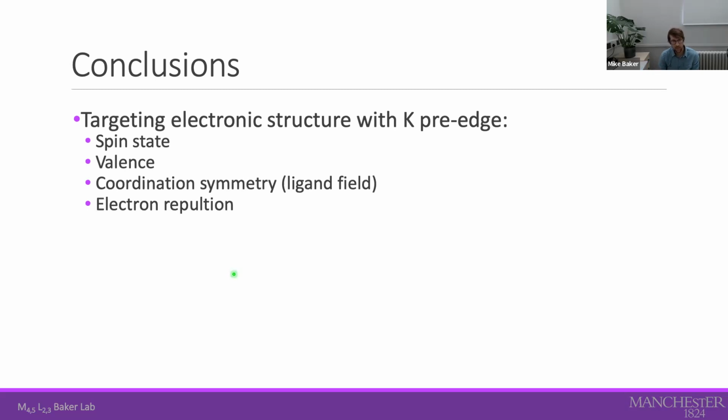Ab initio theories can be good at estimating this. However, by comparing to experiment, one can then scale those Slater integrals to get a more precise quantification of electron-electron repulsion. And that can have implications on covalency, the amount of delocalization, for instance, of the 3D ions reduces an electron-electron repulsion, and therefore parameterization of the electron repulsion can have an indication on covalency.